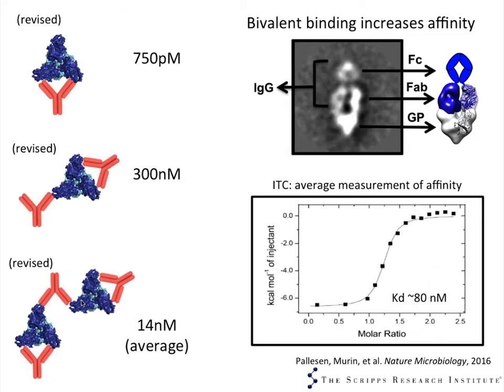Now we also analyzed this GP 13C6 interaction using another solution-based technique called ITC. And it's worth pointing out that the average stoichiometric ratio of 1.2 corresponds to the CG-MALS result where we have mostly 1-to-1, but also some 2-to-1 and 3-to-2 associations as well. However, ITC does not have the capability for identifying and extracting the KDs of these multiple complexes that are occurring simultaneously in the solution. So the KD for the 13C6 GP interaction obtained through this technique is quite a bit higher than that we obtained for the CG-MALS experiment.